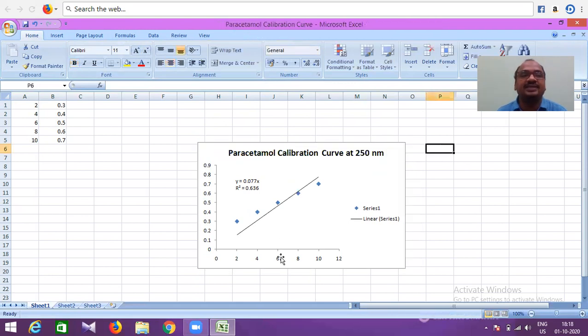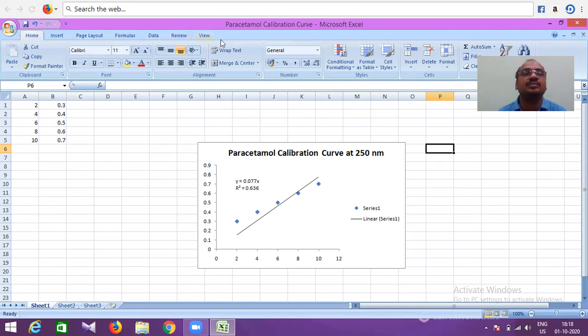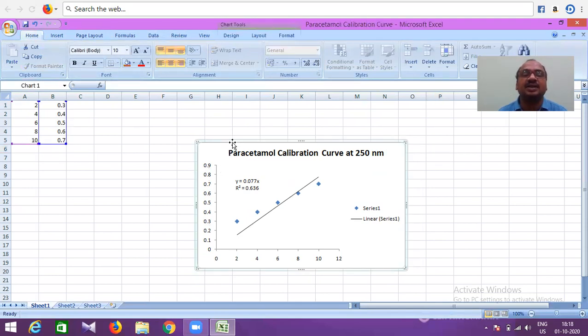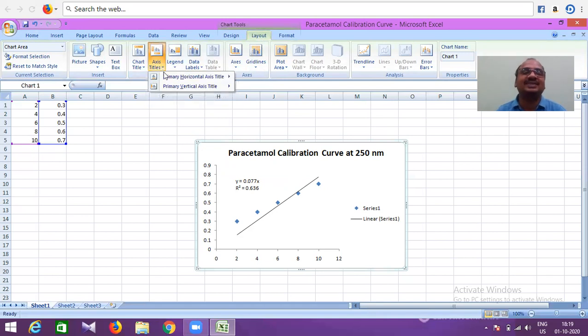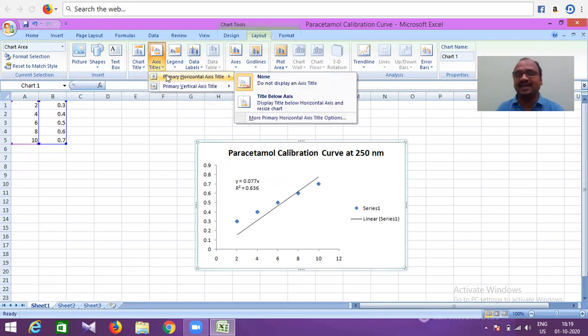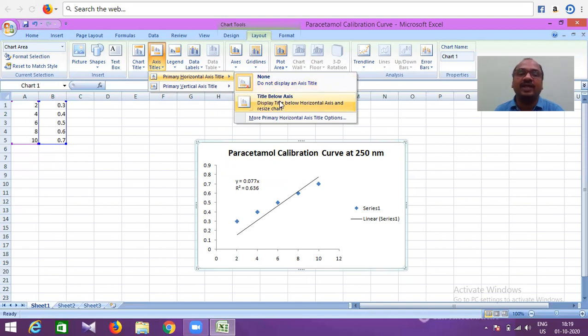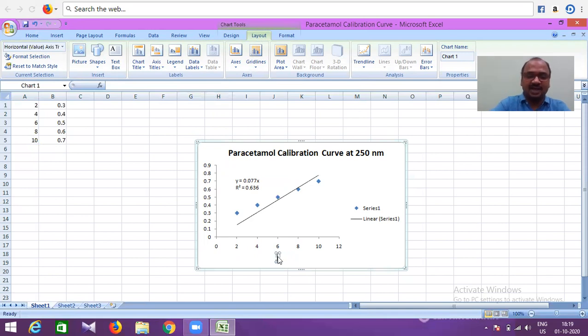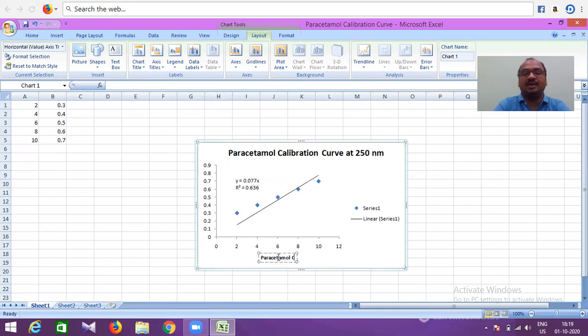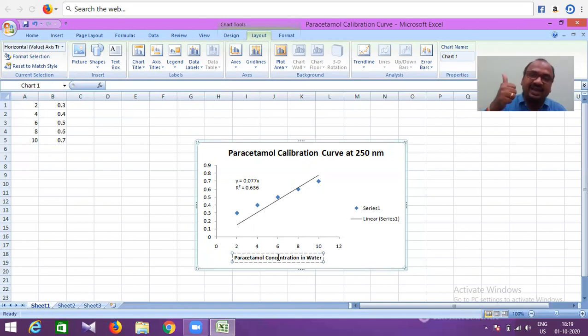Now you want X-axis. Click on the chart—this is important. Click on the chart and go to Layout, then Axis Title. Put X-axis: Primary Horizontal Axis. Horizontal axis is always X. You want none? You don't want to write? Title below the axis. Here I got it. Now, what is this? This is paracetamol concentration in which solvent—in water. You write it, mention it. Nanometer also you can mention. If you mention, it's a valid graph.